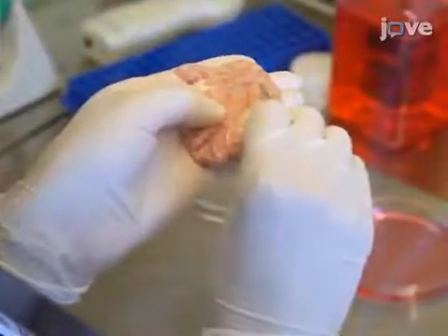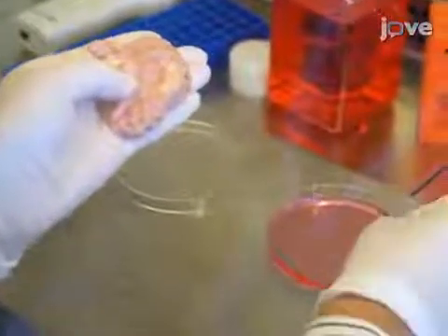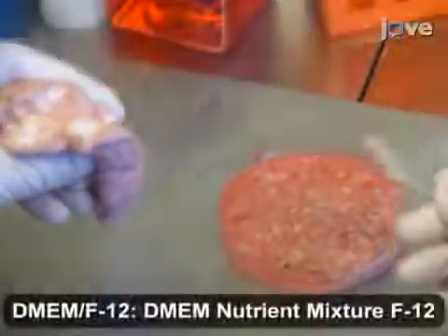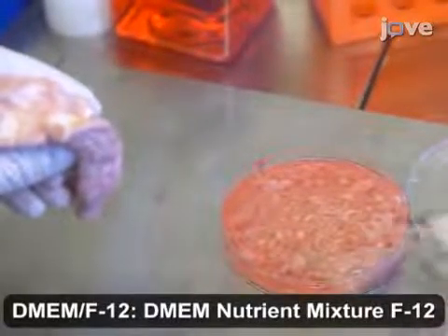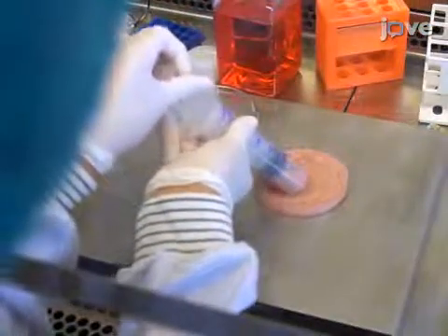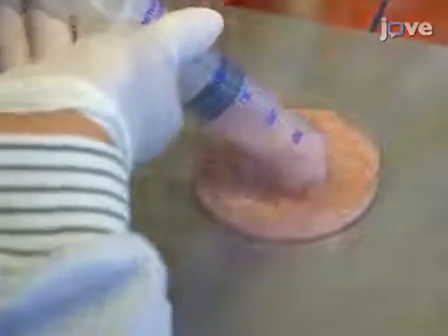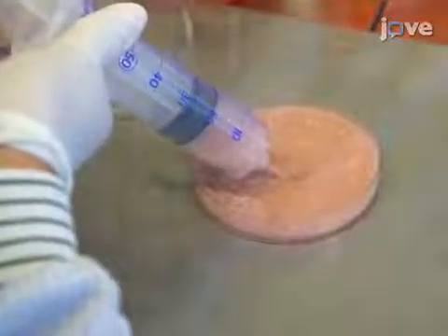Using a scalpel, scrape off gray matter from the brains one at a time and transfer the isolated material to petri dishes containing 20 milliliters of DMEM F12 placed on ice. For initial fragmentation, run the gray matter material through a 50 milliliter syringe without the needle. Repeat the procedure for all brains and pool the collected gray matter material together.